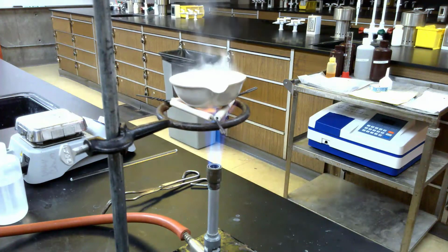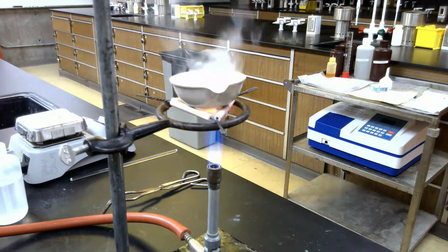Theoretically, what's left in the evaporating dish should be the mass of the mixture minus the mass of the ammonium chloride we used, because theoretically we're driving all of the ammonium chloride off through heating. So the only thing we've done is just heated the ammonium chloride to drive it off. The mass remaining should just be the other two components that we started with, since we've done nothing to them, and we'll see if that's the case.